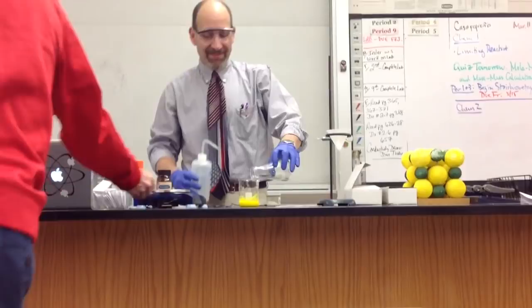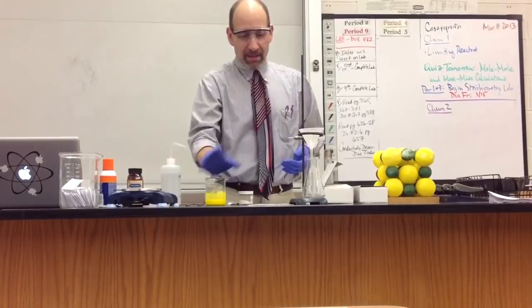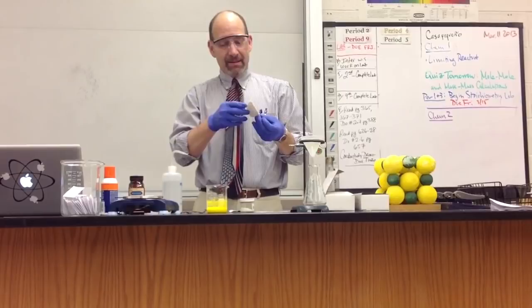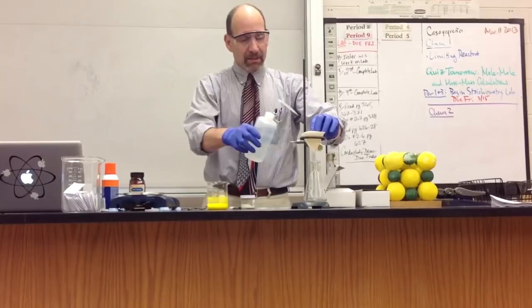And now I'm ready to do my filtration. Normally, what I do is I put this in ice to cool it down a little bit to make sure it all precipitated. But I just wanted to demonstrate for you the idea of doing this. So remember from our sanitol at the end, Lisa. When the reaction took place, was the glass heated at all? No, it didn't. This reaction doesn't give off a lot of heat.